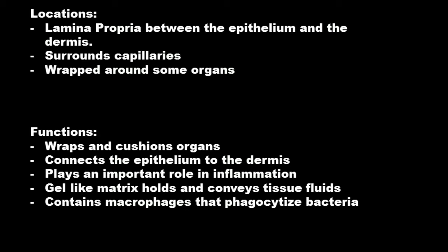Its functions are to wrap and cushion organs and connect the epithelium to the dermis. It plays a very important role in the inflammation system. It has a gel-like matrix that holds and conveys tissue fluids, and it contains macrophages that phagocytize bacteria.